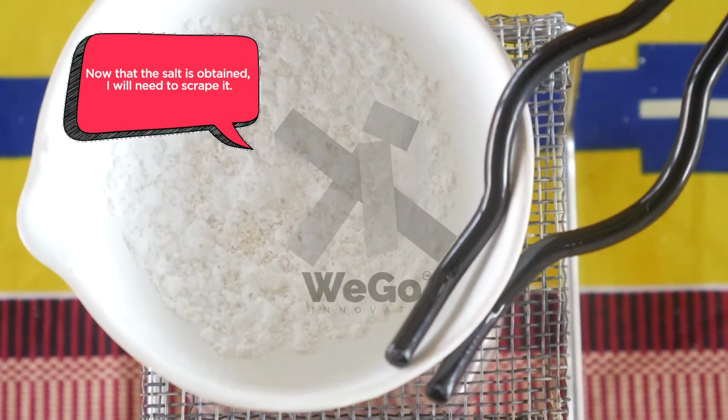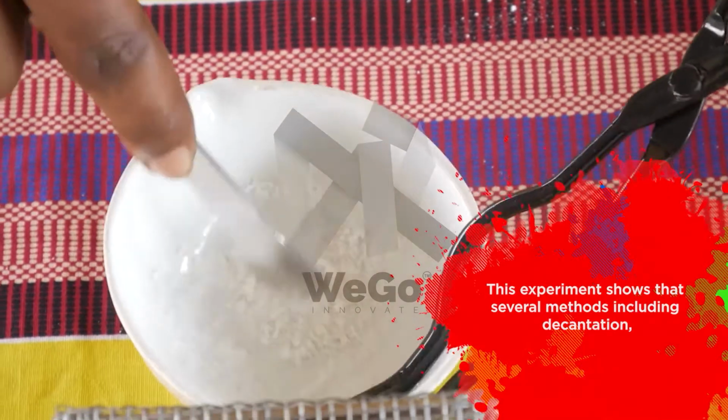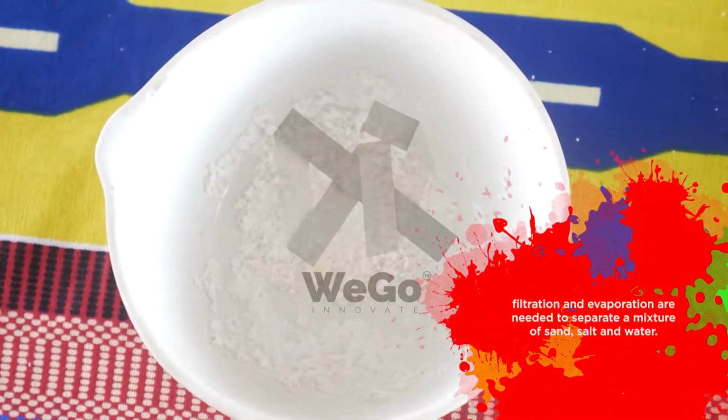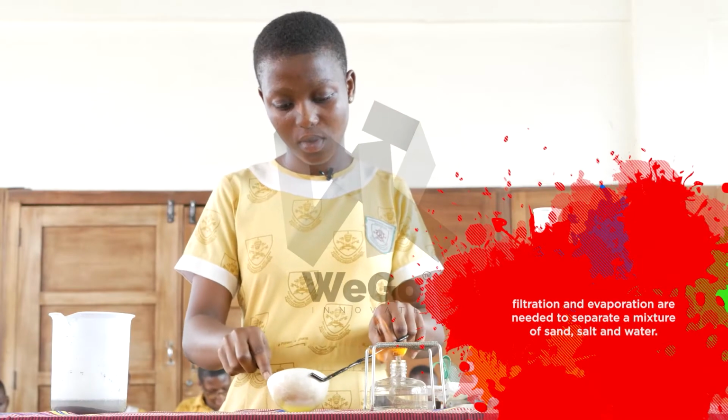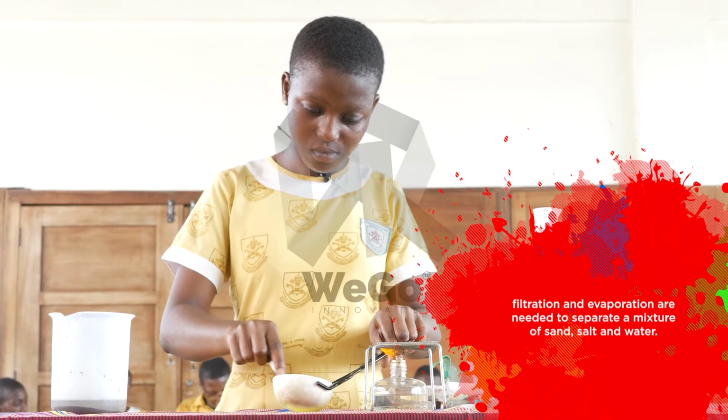Now that the salt is obtained, I'll need to scrape. This experiment shows that several methods including decantation, filtration, and evaporation are needed to separate a mixture of sand, salt, and water.